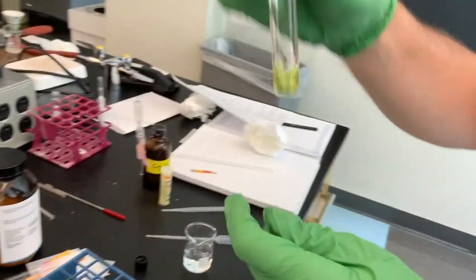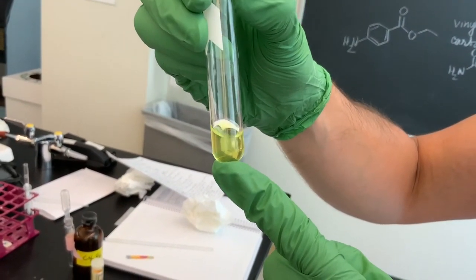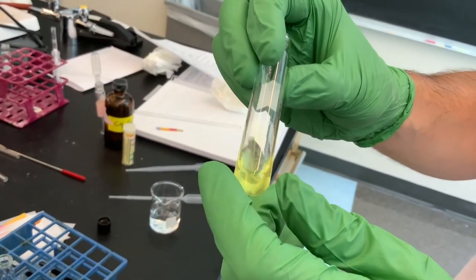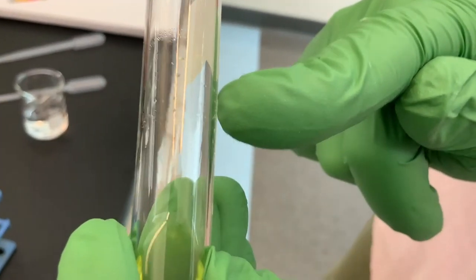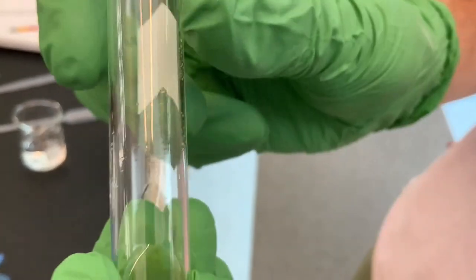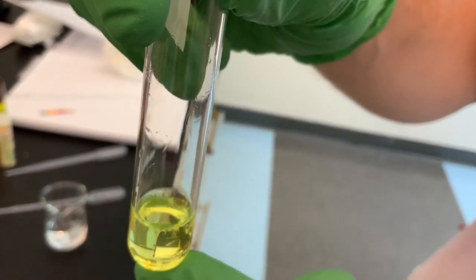All right. So now I've transferred the 9-fluorenone methylene chloride into a new culture tube, and I tried to really get it away from water. But you can clearly see that there is some, because you can see it stuck to the sides of the glass. Methylene chloride does not do that. If I shake this, methylene chloride is not very viscous at all. It'll run down the tube completely. Also, you can see that there are some bubbles of water still remaining, and definitely water stuck to the sides of the glass there.